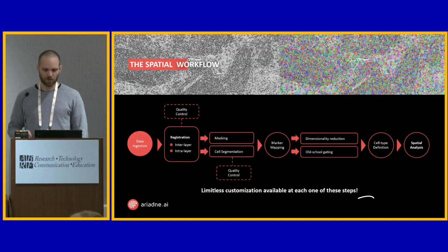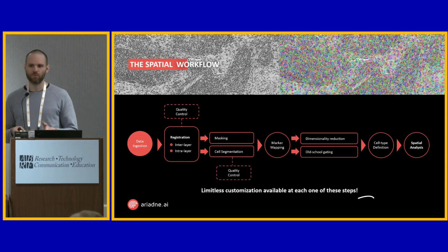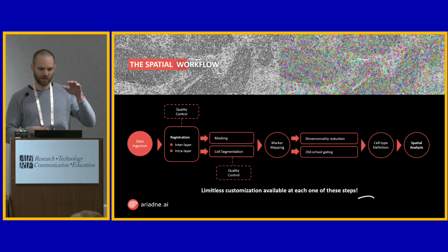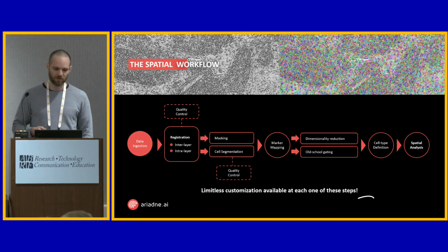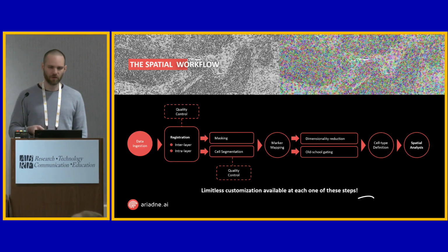All right, so I just want to briefly talk about the core workflow. I call this the skeleton workflow. That's the workflow that Spatial is built around. There are a couple of bells and whistles, so to speak, around the skeleton as well, add-ons, but this is the basic workflow. So it starts with data upload through your web browser, and once that has happened, that's when the data is available for viewing and for further processing in the online tool.